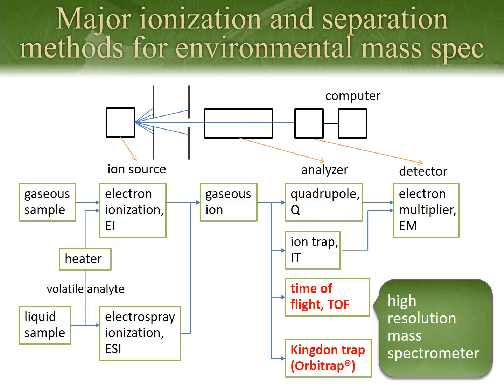In the second video, we learned that time-of-flight mass spectrometer and Orbitrap can measure a mass of an analyte with high resolution. High-resolution mass spec is capable of distinguishing 2 ions of slightly different m/z. Let's see the example of high-resolution mass spectra.